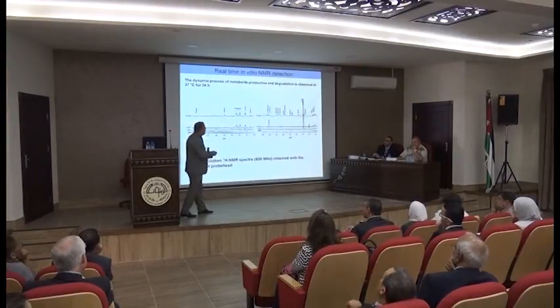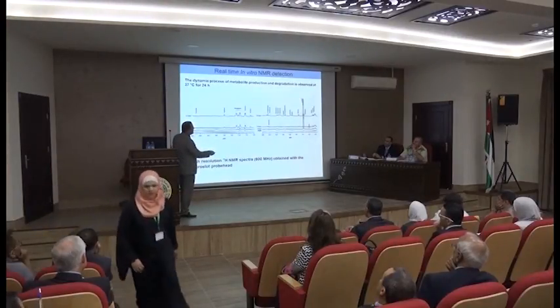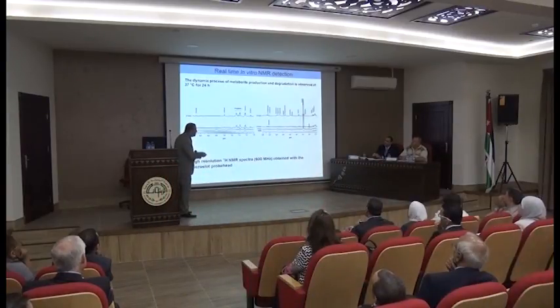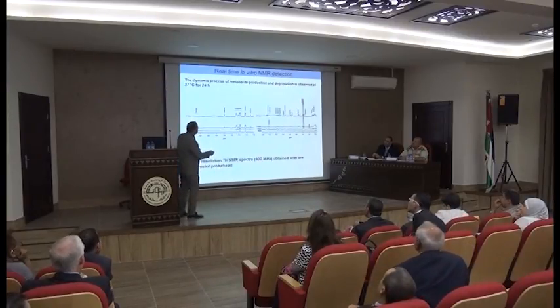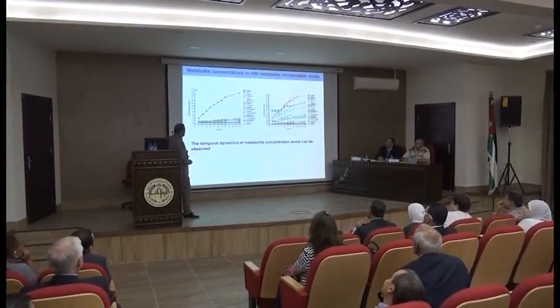Because the people just come to that last stage here, when it's extraction. And then they make general information about just the last stage. They were not able to study it with time. Because they just take the sample, make the extraction, and then analysis, and they say that we have, for example, ethanol. But if you look at the measurement, we are even able to study quantity.